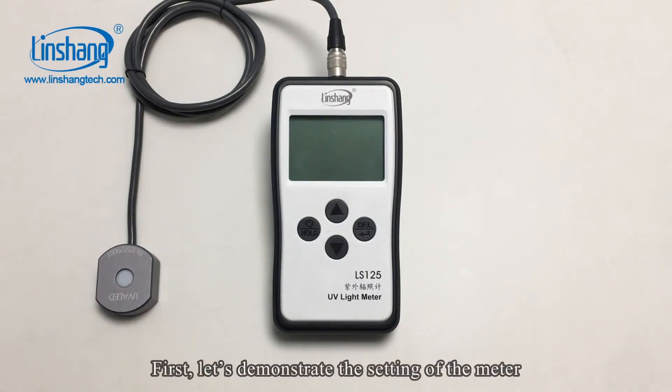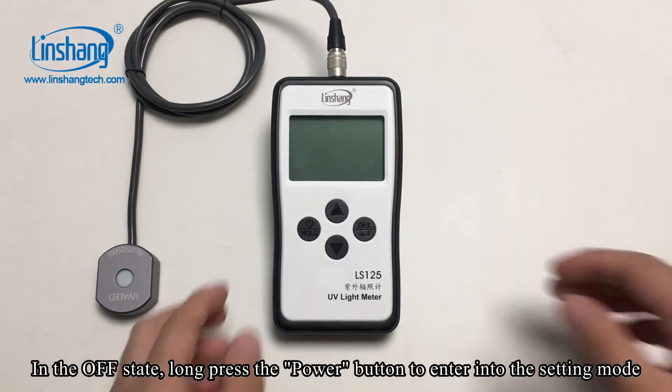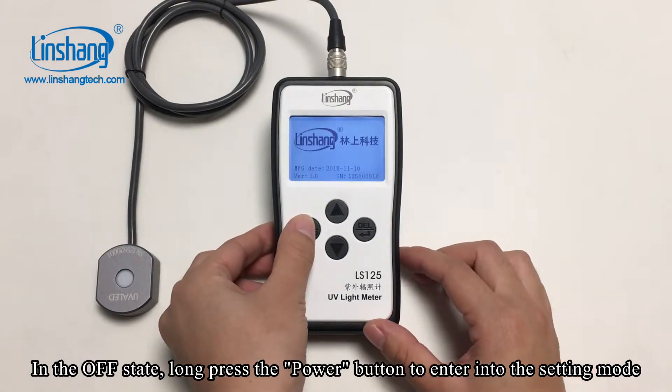First, let's demonstrate the setting of the meter. In the off state, long press the power button to enter into the setting mode.